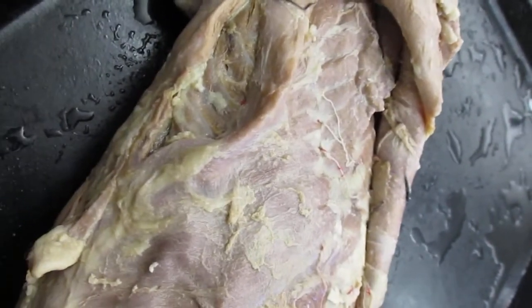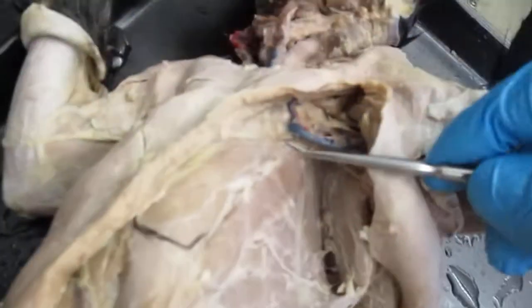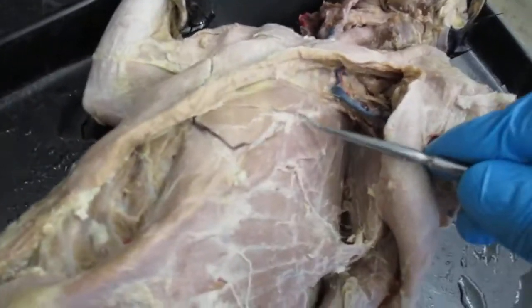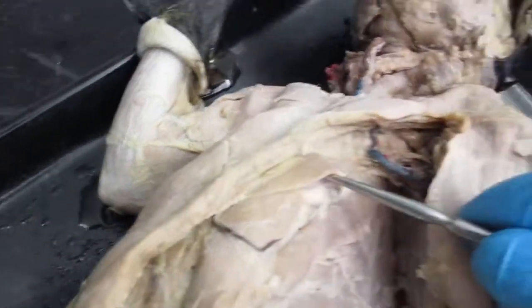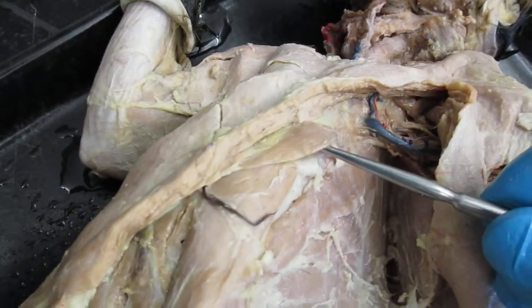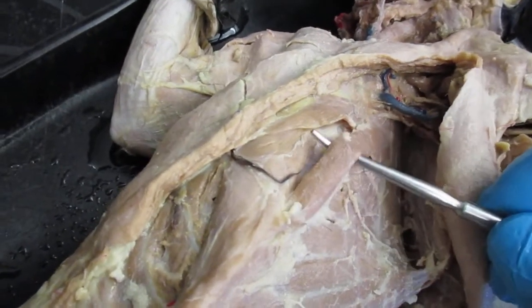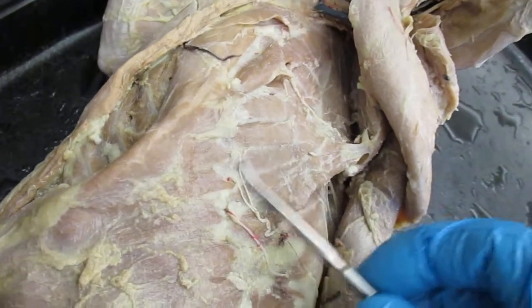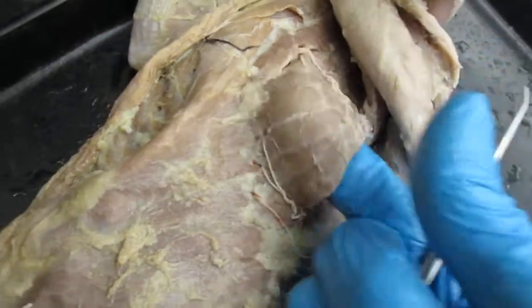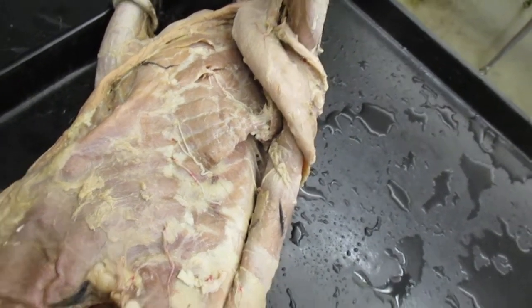Okay, I want to move on to the transversus costarum. So here's your transversus costarum. Right here, transversus costarum right there. Scalenus medius is right here. And then your serratus ventralis right here. Okay. Let's move on to the next thing here.